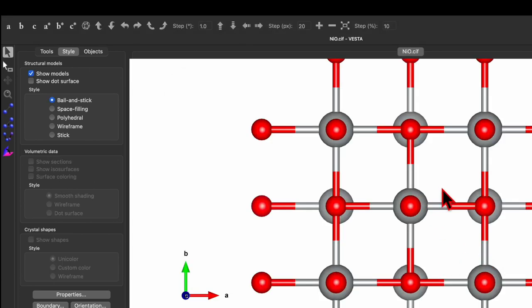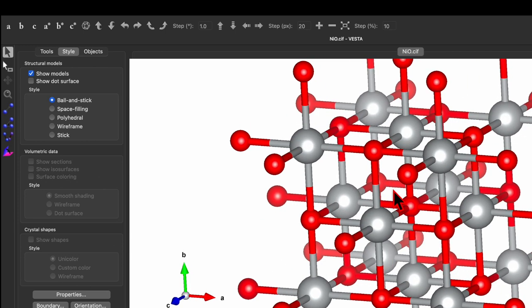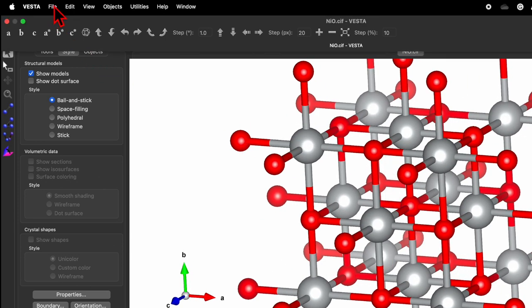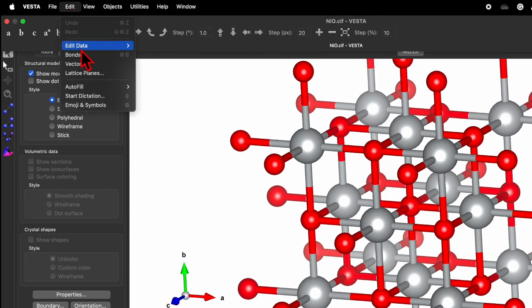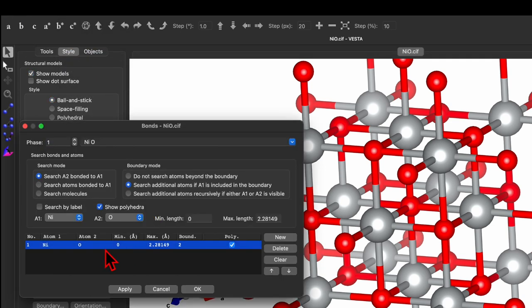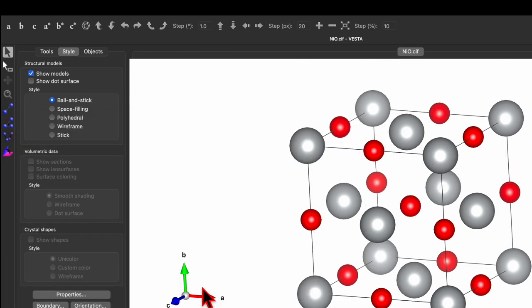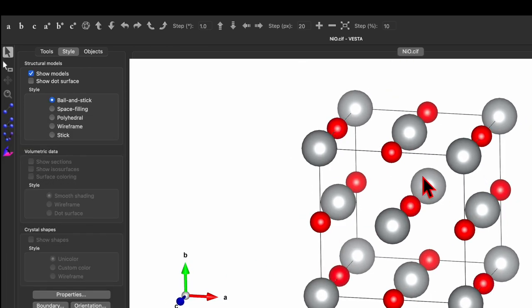Here we can see the unit cell of nickel oxide, and I don't want to see the bonds. Go to Edit and click on Bond. Here we can find the bond between nickel and oxygen — delete this entry and click OK. This way we can remove the bond.